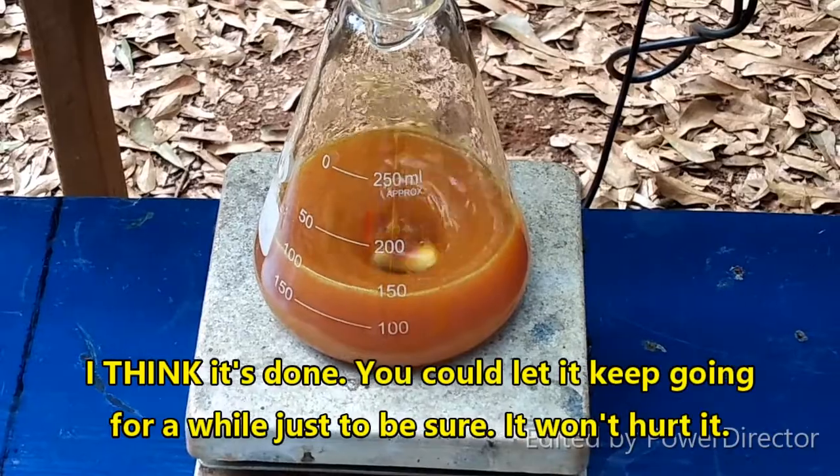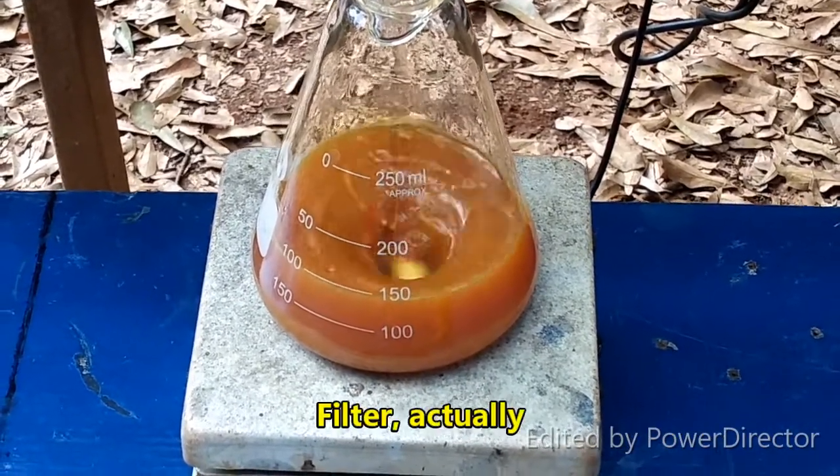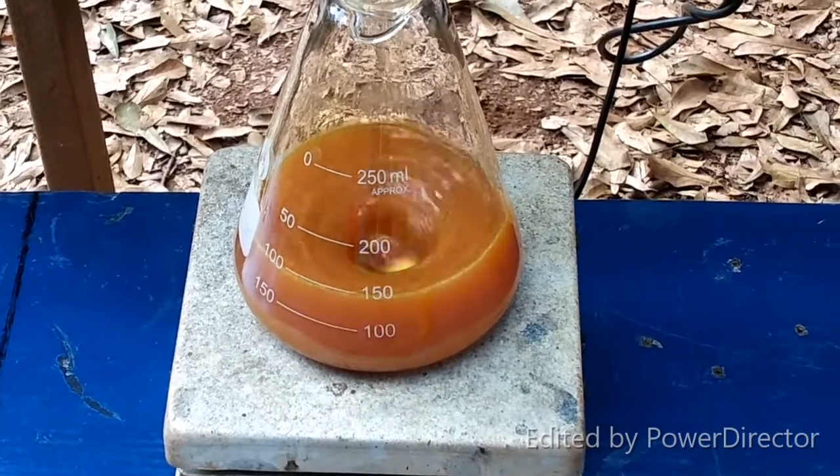So I'm going to let this heat back up and hopefully all dissolve again. And then I'm going to try to decant this and see if we can get it to crystallize.